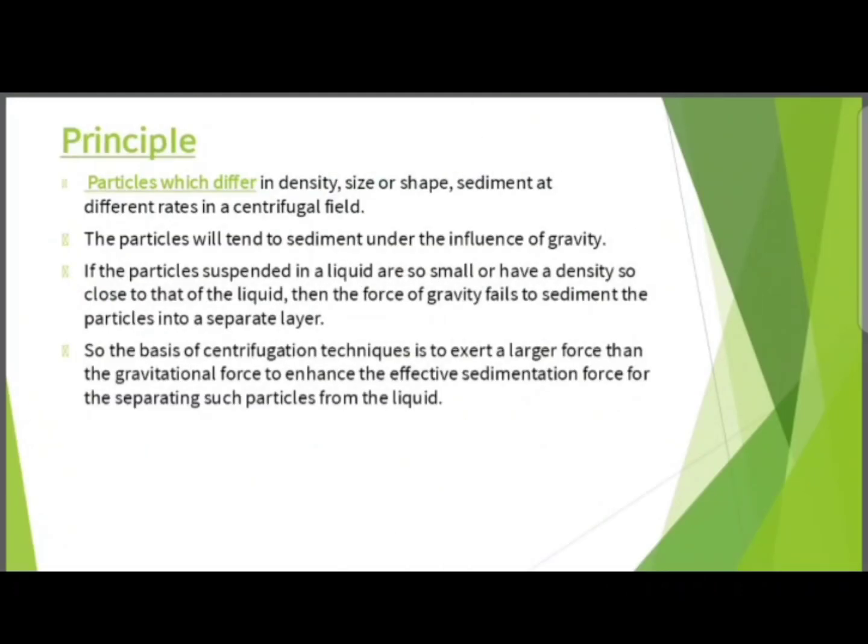Next, the principle: particles which differ in density, size or shape sediment at different rates. The particles will tend to sediment under the influence of gravity. If the particles suspended in a liquid are so small or have a density so close to that of the liquid, the force of gravity fails to sediment them. The basis of the centrifugation technique is to exert a force larger than the gravitational force to enhance the effective sedimentation force for separating such particles from the liquid.